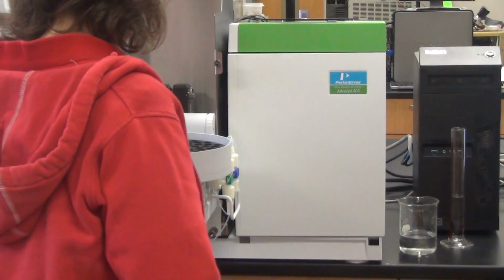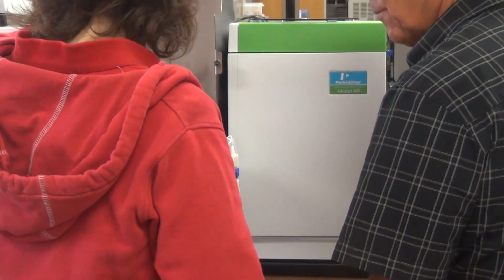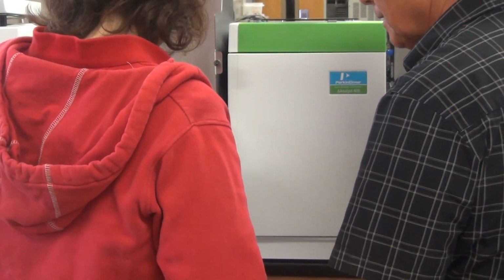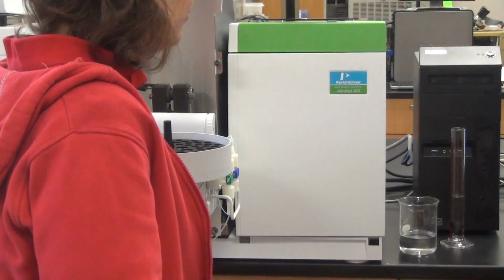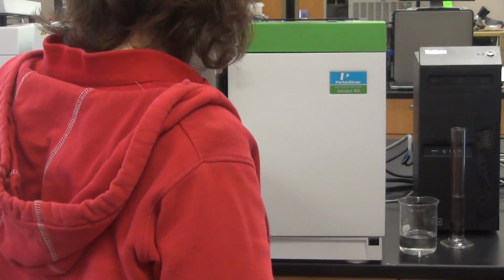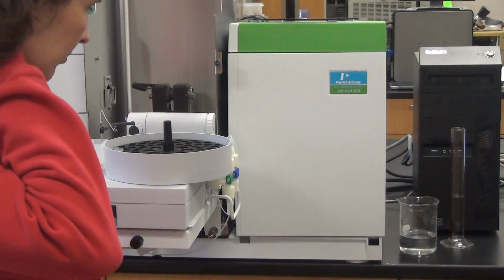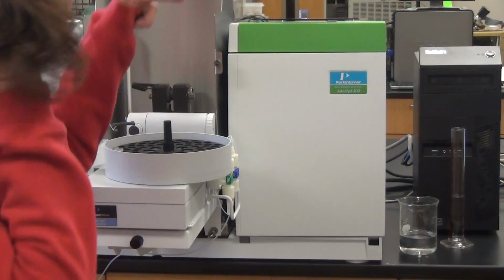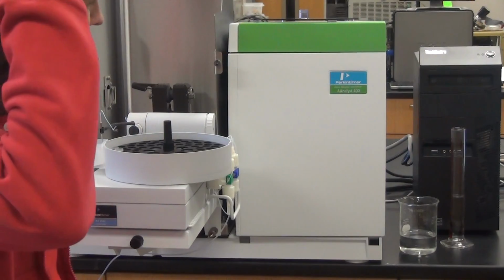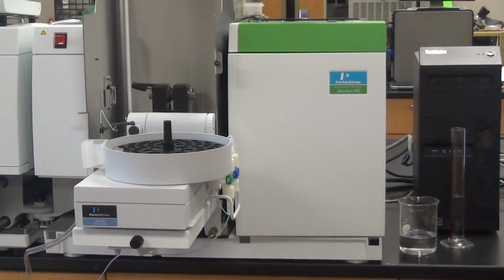So what it would do if I hit analyze all is run the standards, which I haven't set yet. It would run my blank, run my standard, and then it goes to 12, and then it'll go to 14. Or I can hit calibrate, which is just run a blank and the standards.